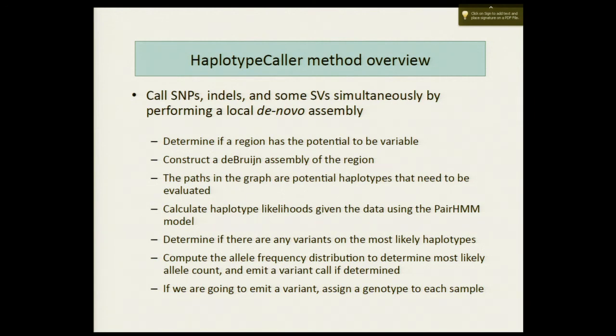Okay. So, like everyone's been saying, the Haplotype Caller is a brand new fancy thing. I'm going to try to describe it by contrasting it with the Unified Genotyper. So the major difference between the Unified Genotyper and the Haplotype Caller is that the Unified Genotyper is sort of trapped in this per locus view. You come to a locus and you go to each one independently.